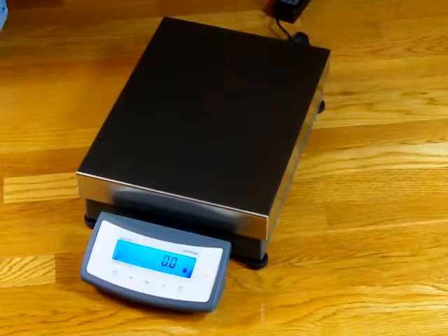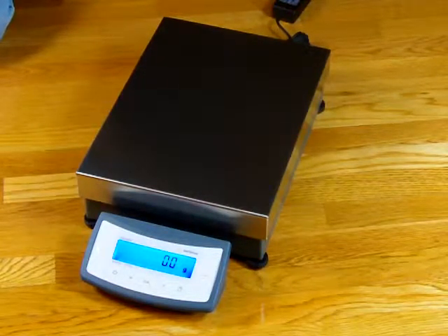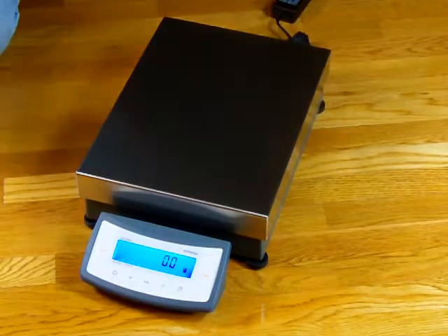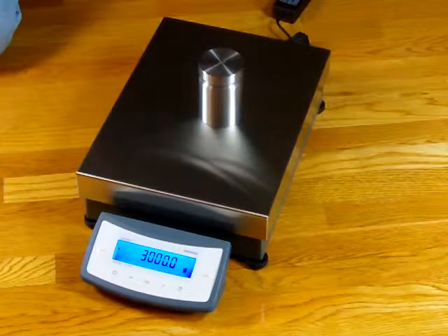Welcome to Precision Weigh-In Balances. We'd like to show you this is the Sartorius CPA High Capacity Balance. This particular model is the Sartorius CPA 3401S — that means super range. This balance has a capacity of 34,000 grams by a tenth of a gram, and you can see the response time on this product is extremely fast.